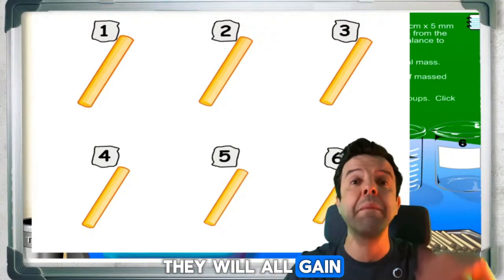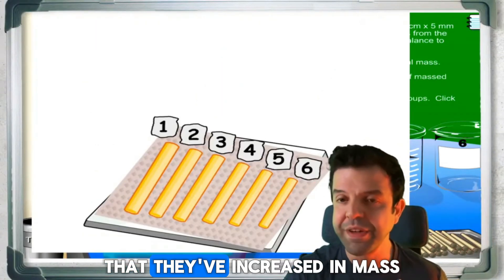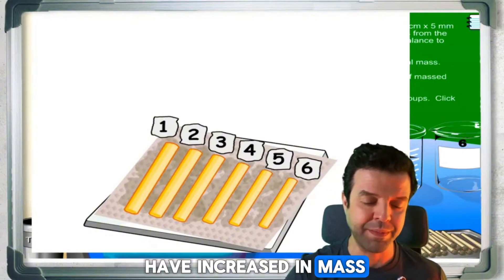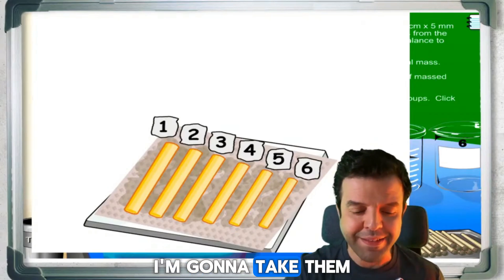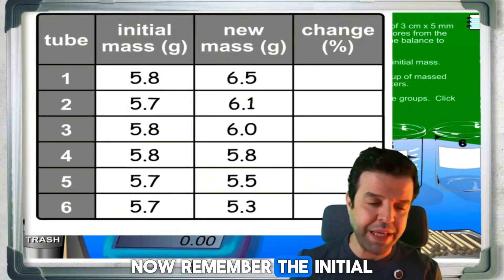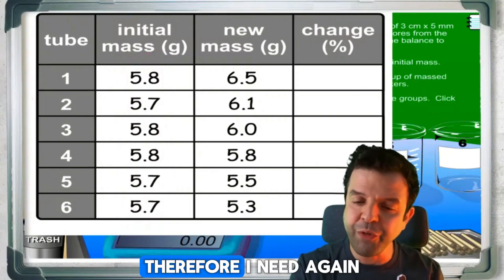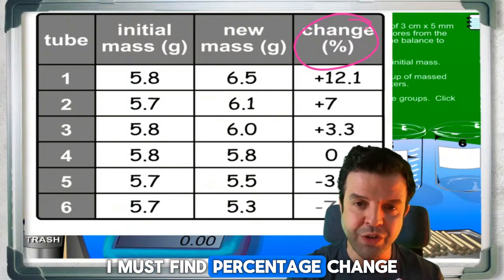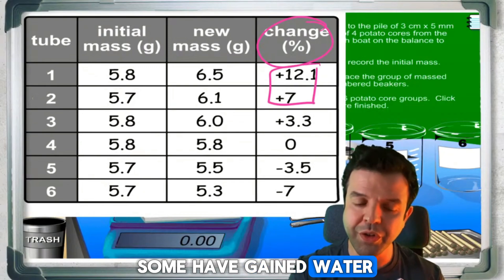Drying is a must. If you don't dry them, they will all appear to gain mass because water on the surface will always make it seem like they've increased in mass. In reality, only some have actually gained mass — that's why you must dry them. Once they're dried, take them out and re-weigh. Remember, the initial mass wasn't all the same, so to ensure validity, you must find the percentage change in mass.